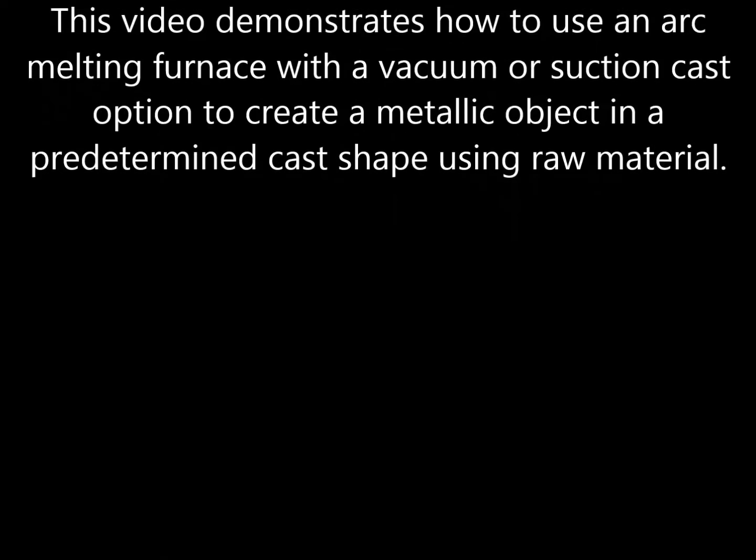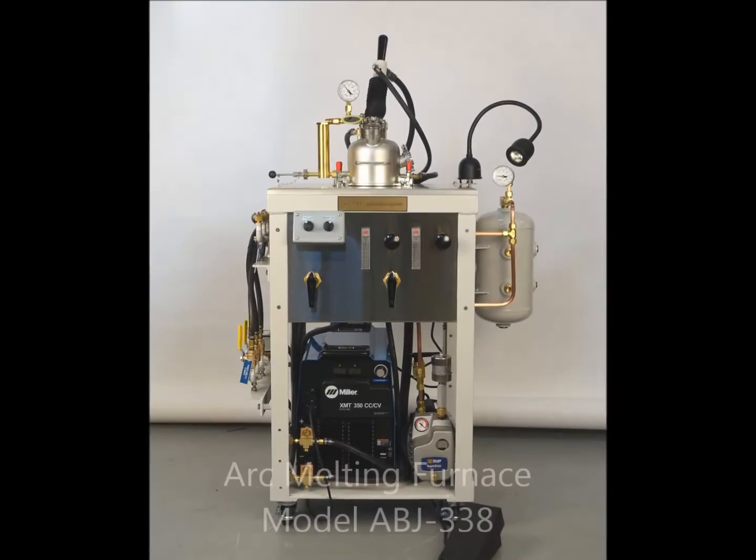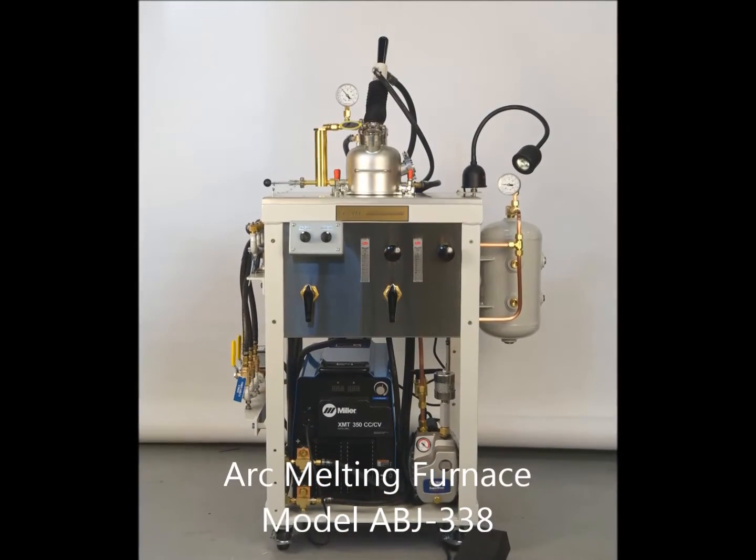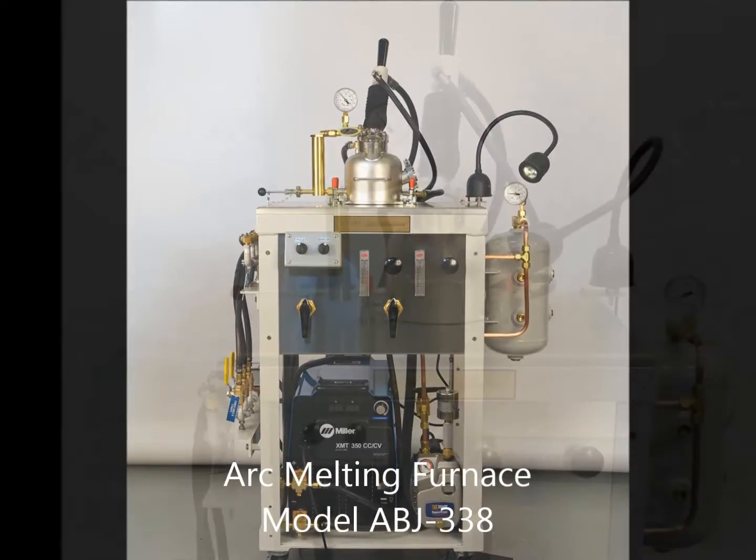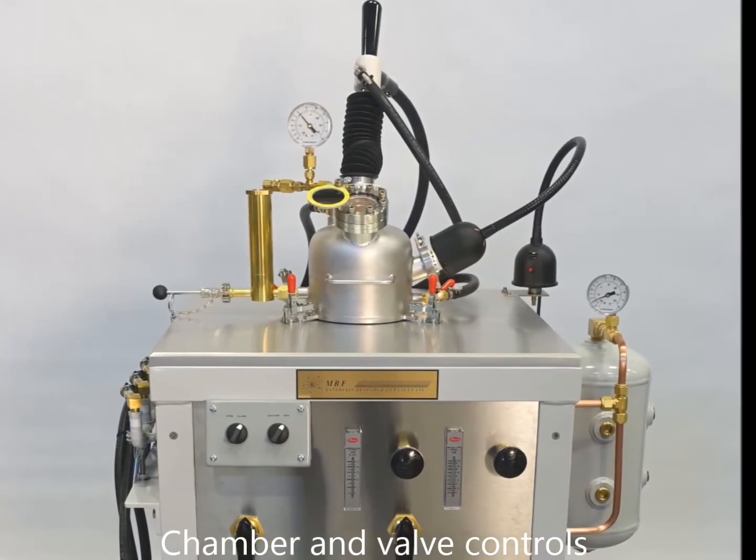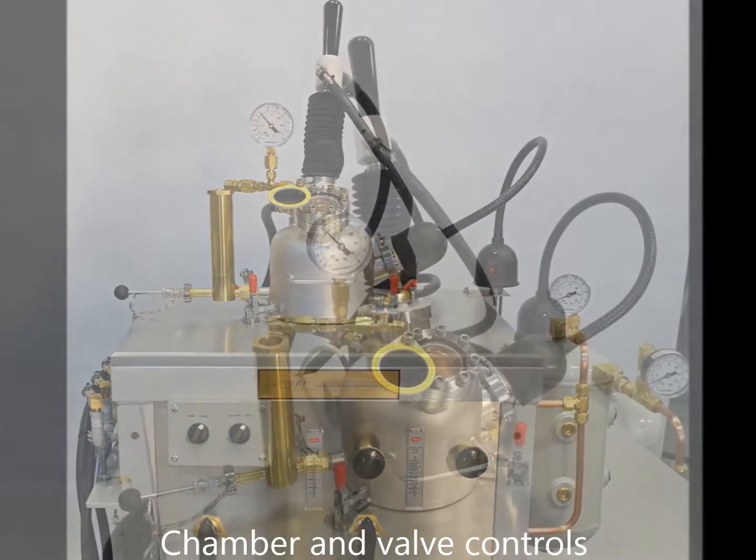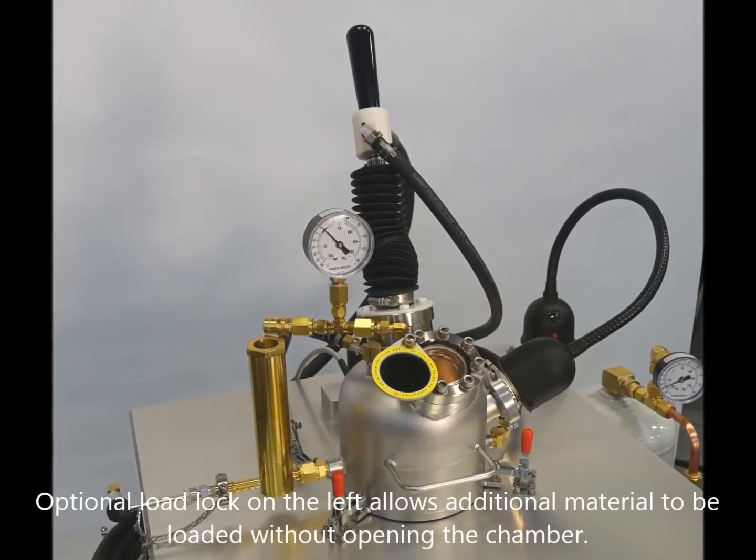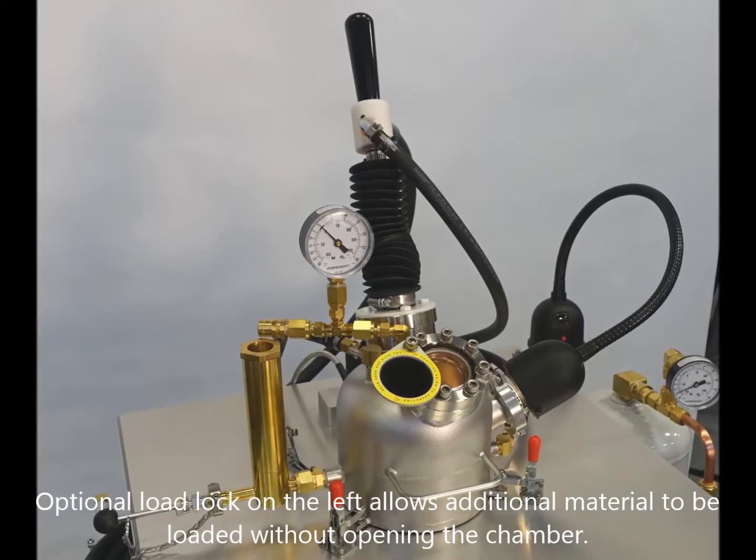Today we'll be going over our vacuum suction casting with our ArcMelt model ABJ338. The 338, with its sleek and simple design yet durable construction, is easy to use and understand. Its small footprint and many options make it a perfect fit for laboratories and universities worldwide.